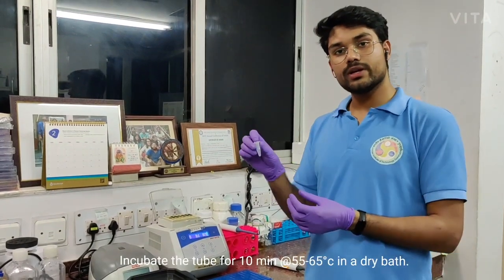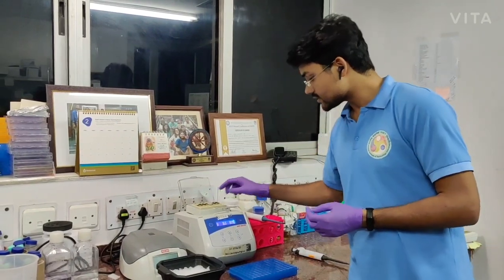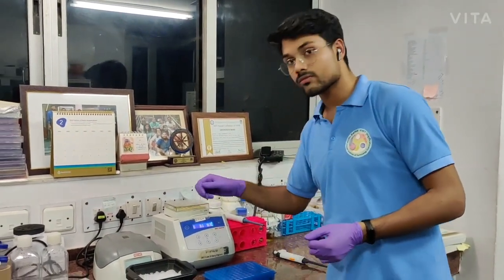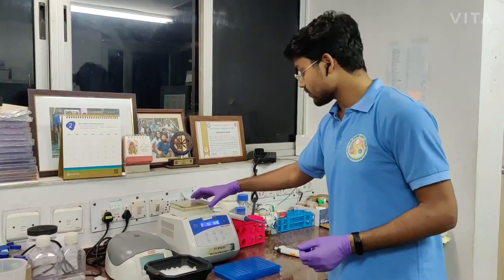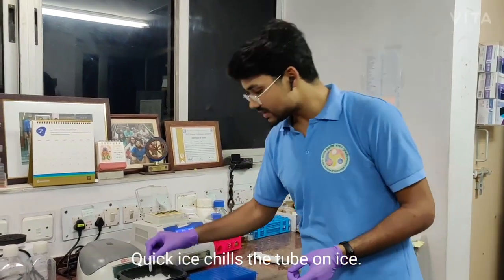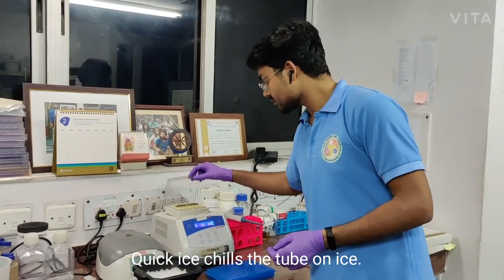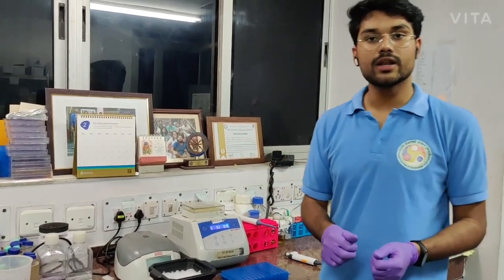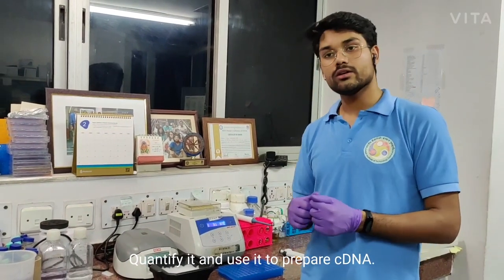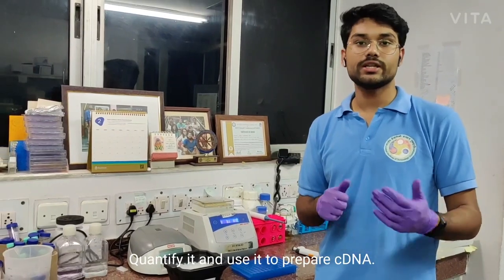Now we incubate this RNA sample at 60 degrees Celsius for 10 minutes. Now after this heating, we quick chill the RNA on ice for 5 minutes. Now the RNA isolation step is done. We can quantify the RNA, how much RNA we have isolated, and then we can use it for cDNA preparation.